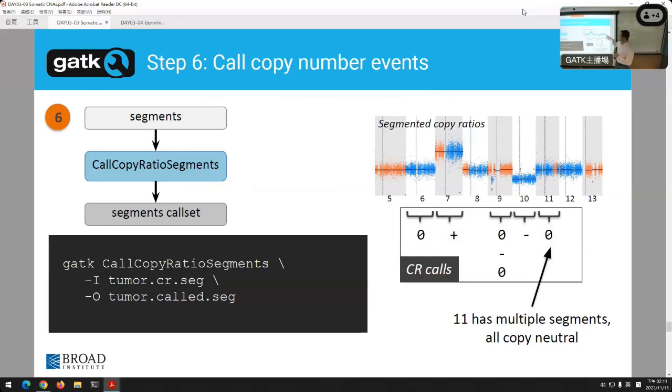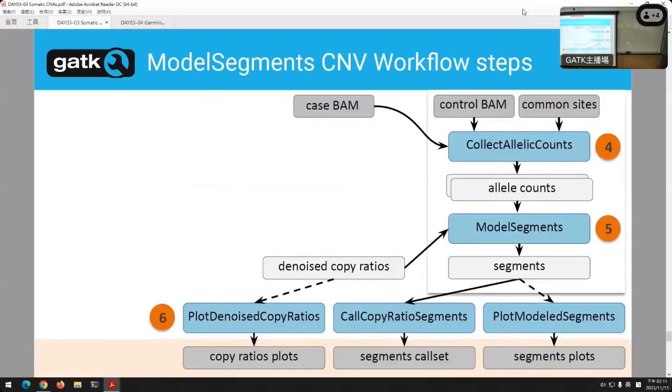And again, what you should see then is here, there's one call for these chromosomes, one here and a little bit here, and not too many. All right, so we've also got the ability to make all those plots. So you'll want to see the exact same plots that we have been showing. Those weren't just special for the workshop. Anyone can make those plots. It's part of the GATK package.